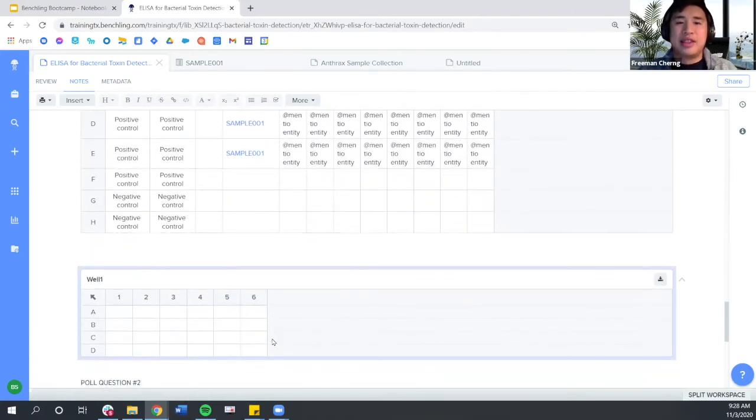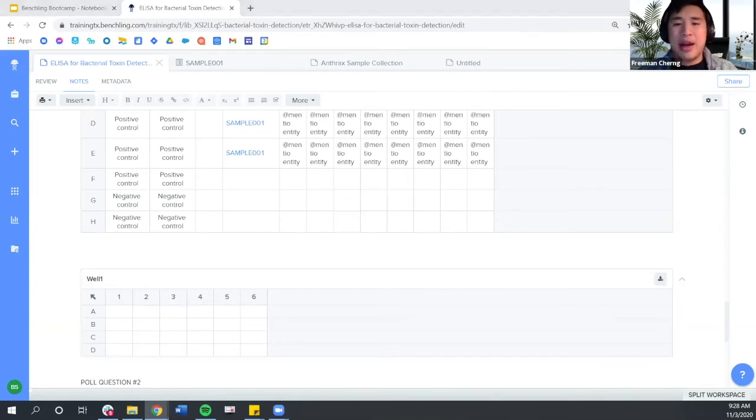Wonderful. So that brings us to our second poll question, which asks, would it be beneficial for you to be able to map out a plate or a table without needing to open Excel every time? So I will go ahead and open this poll question. And again, please take a minute just to put in your responses here. Great. Thank you, everyone, for putting in your responses.